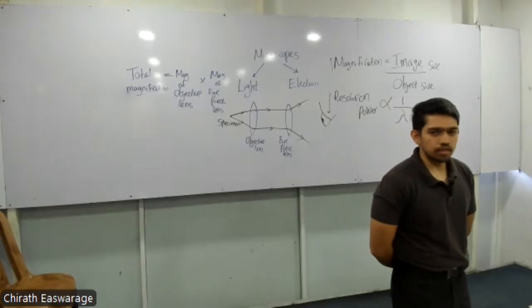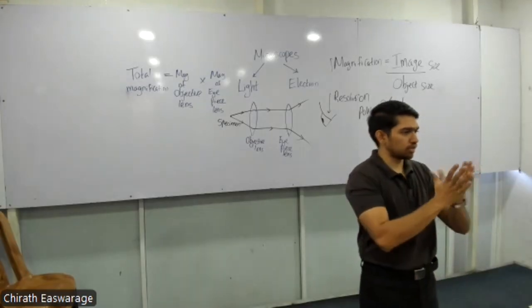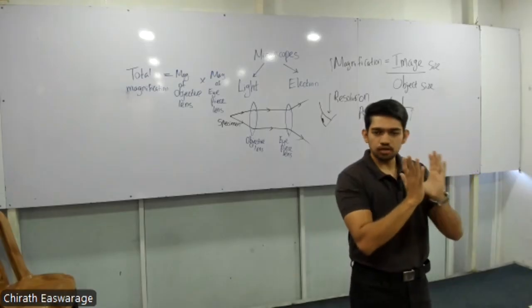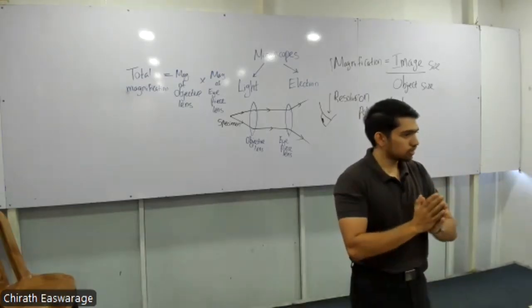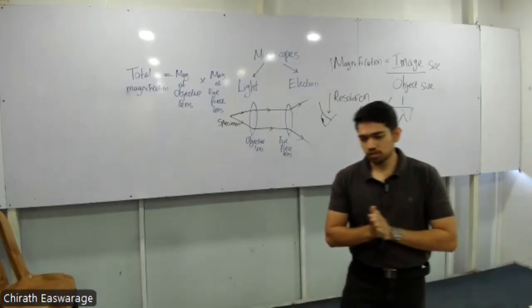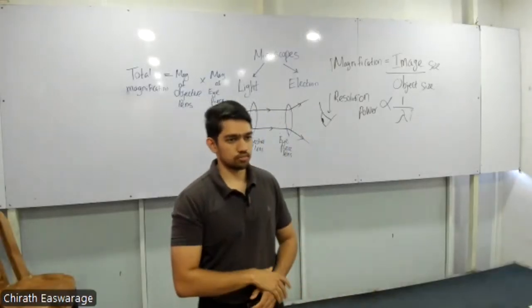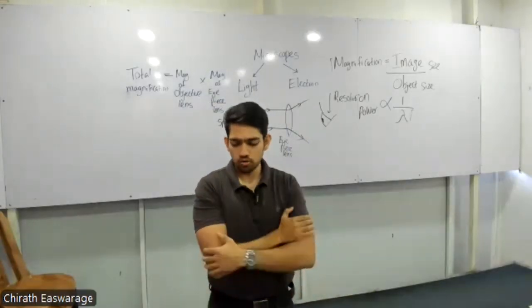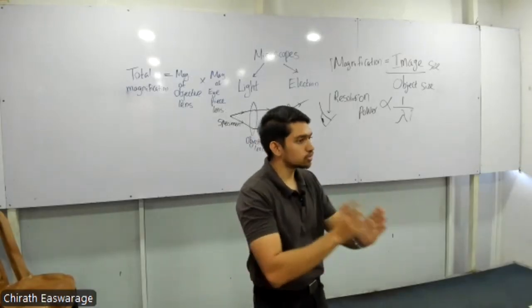Third one, just having a lens, 2 lenses like this, it doesn't do anything. You can't see anything properly without what? Nicely focusing, right? So the third thing is means of focusing. Means of focusing. You have to be able to move means of focusing.